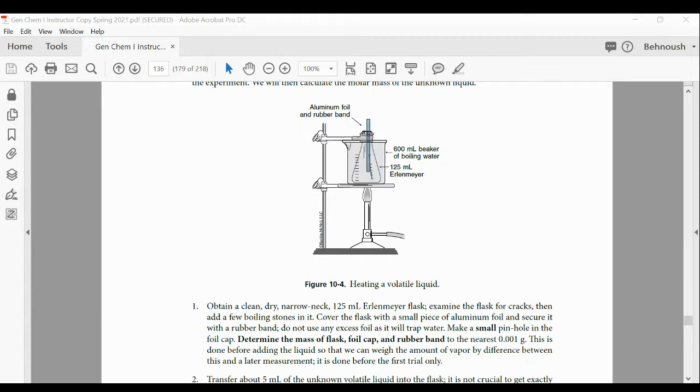Okay, very good. So when you have the volume, temperature, and pressure measured, you can calculate the number of moles. Okay, I have the last group.